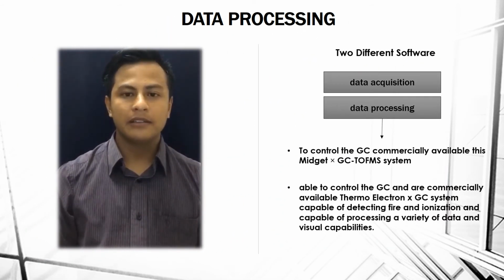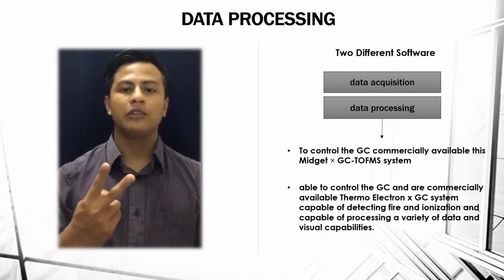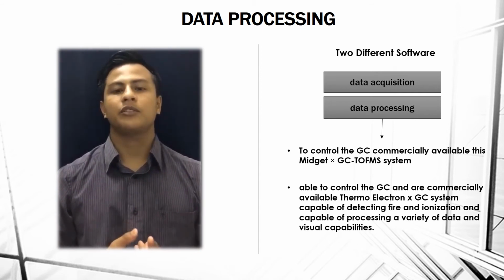The second part is data processing. For data processing, there are two different software. The first software is data acquisition. The second software is data processing.